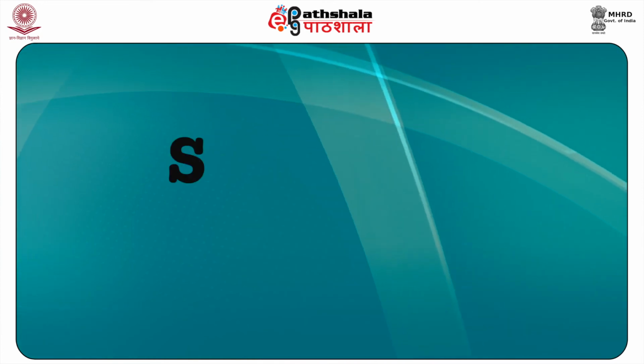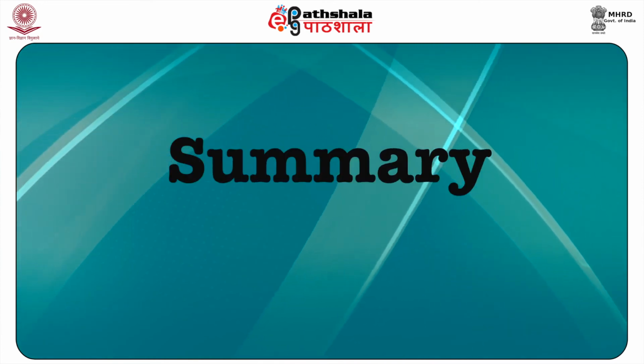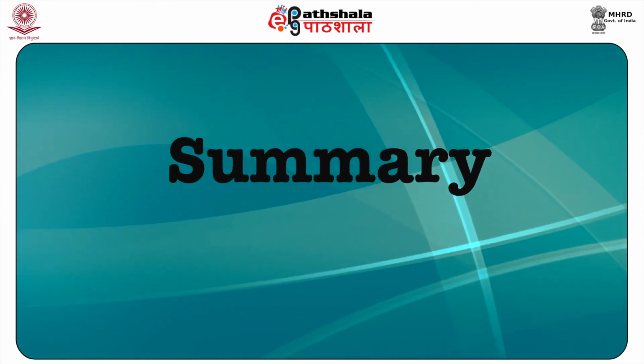For a typical 2D NMR spectrum, 1D NMR experiments are performed a number of times. For example, for a typical 2D 1H COSY spectrum, usually a series of 512 1D spectra is recorded. Dear students, let us now summarize what we have learned in this module.